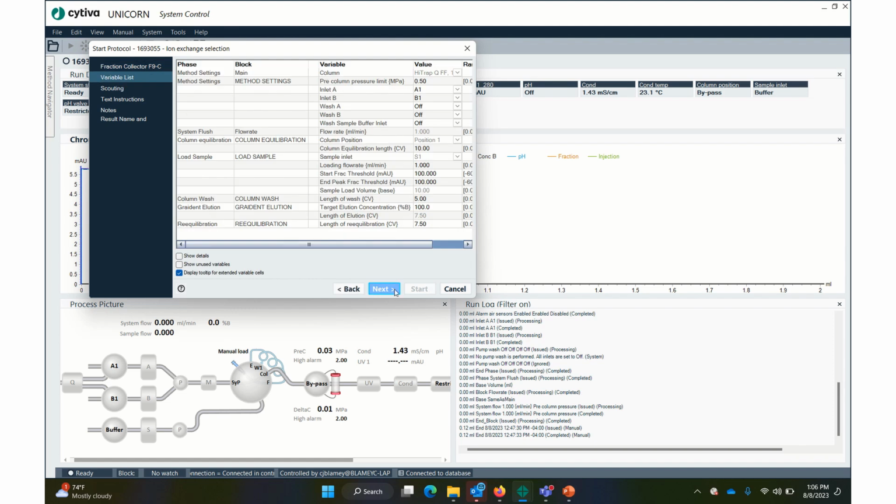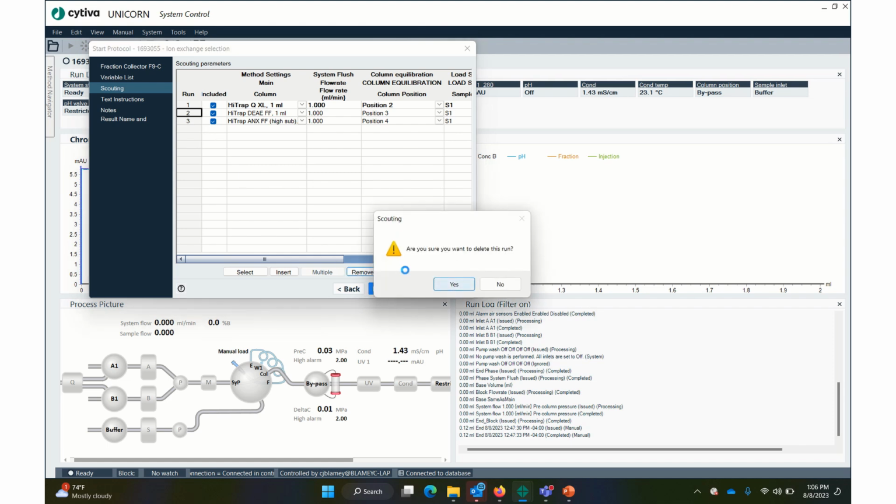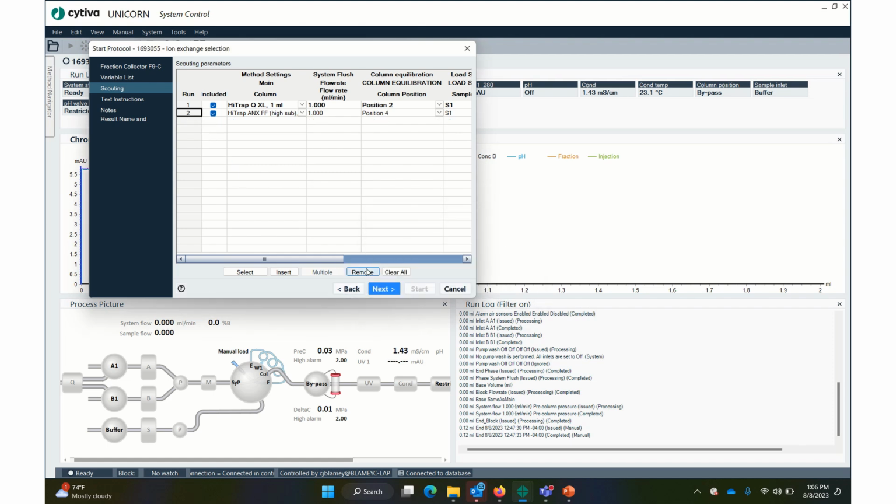I'm going to go to scouting. So we already did 1 run of QXL. So I'm just going to delete the other 4. The whole idea here is we're going to expand on the idea of QXL. So we're going to delete these. Other 3, remove, yes. Remove, yes. Okay, so let's do 2 more.